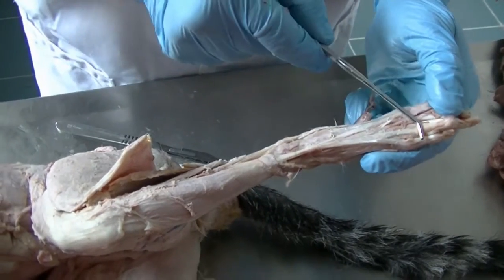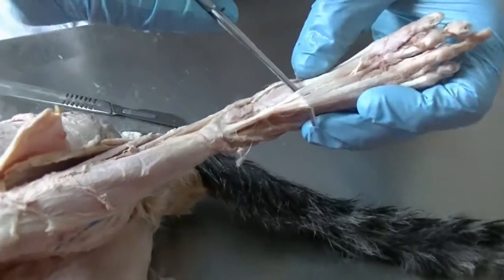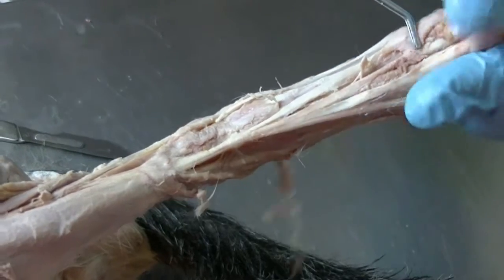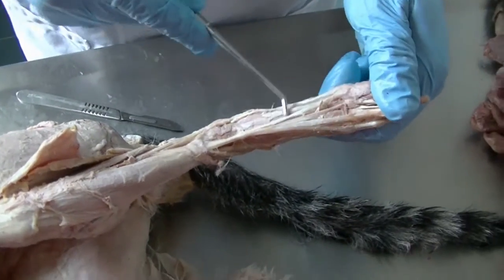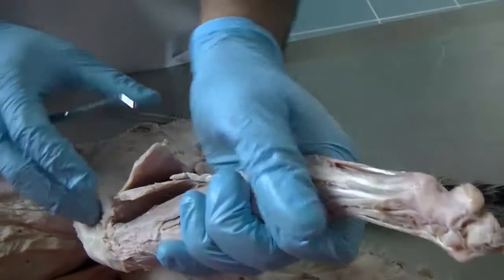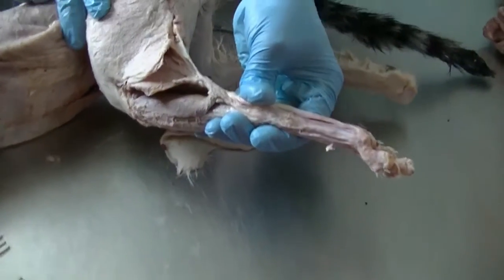The long digital extensor is called long digital extensor because there is a short digital extensor located below the tarsus, and that is why we see 2 different sets of tendons going on the dorsal aspect of the digit. It's because of the long digital extensor and short digital extensor. The short digital flexor muscles are also reported in the cat. Those would be present along with the digital flexor muscles on the caudal surface.